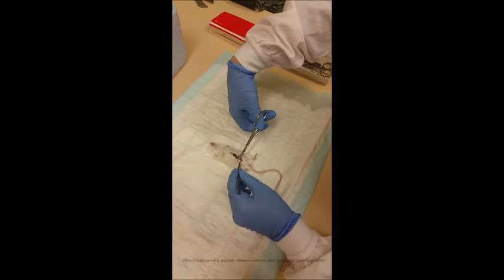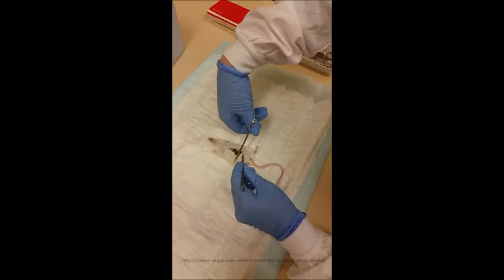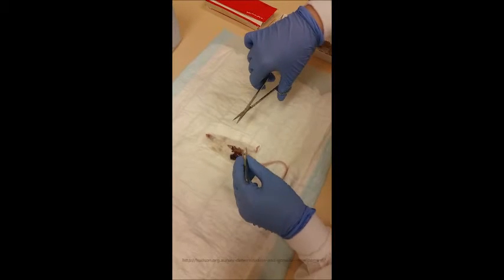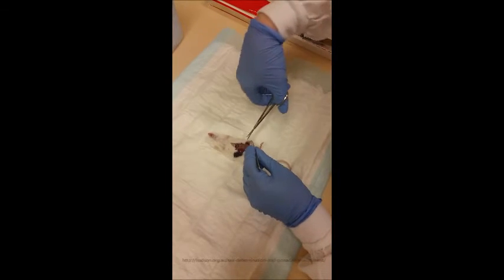Cut upwards, and then once you've done that you want to make a cut to either side. As you do this, you should be able to see the embryos underneath - they're like big bulging beads.